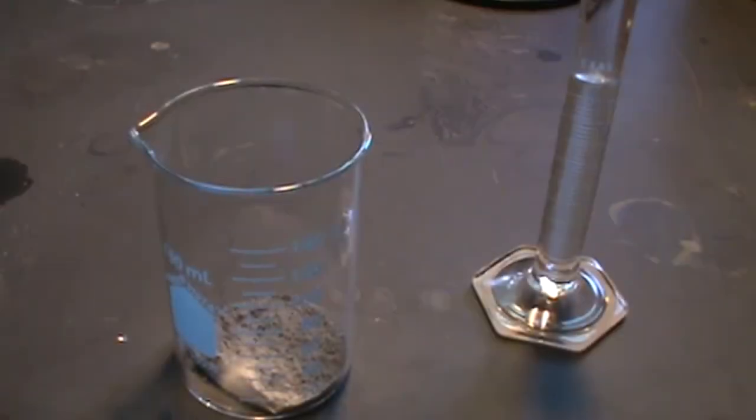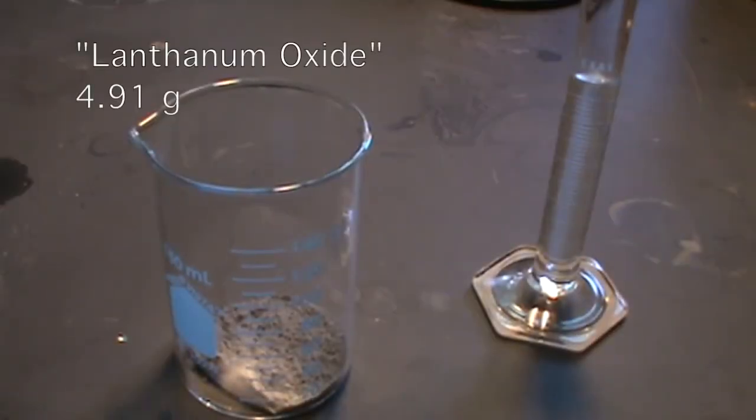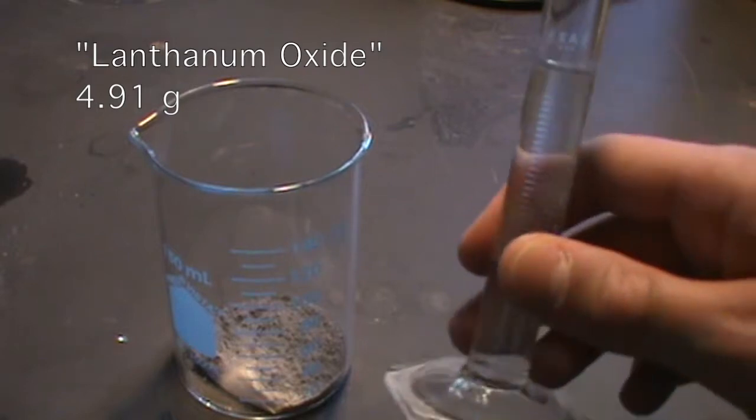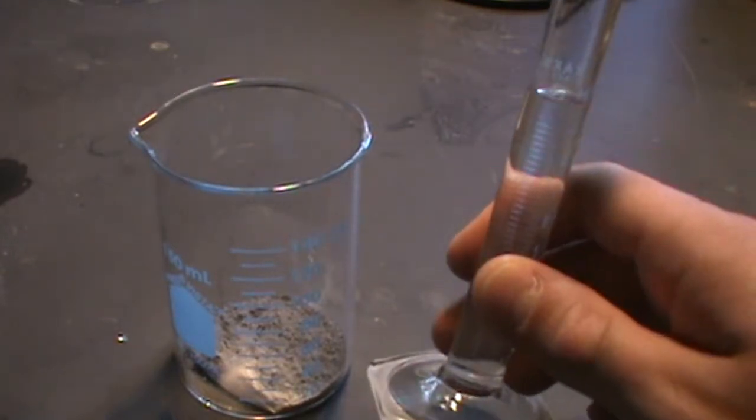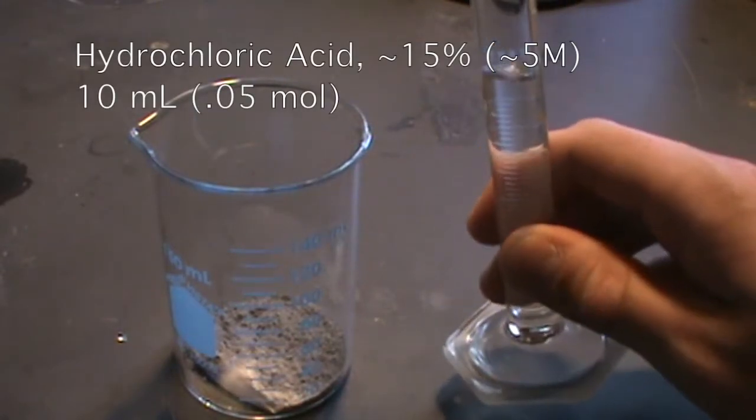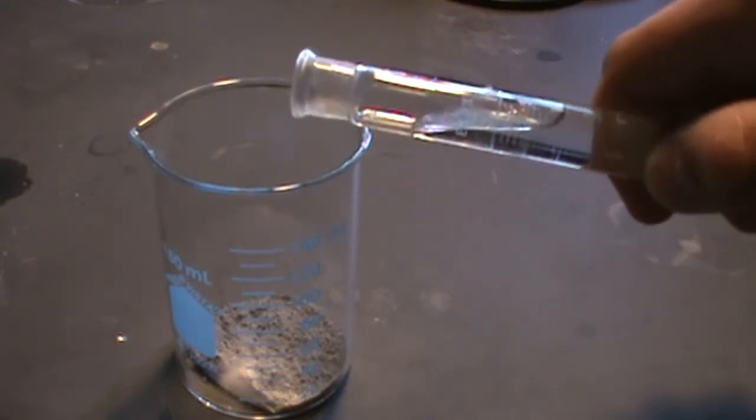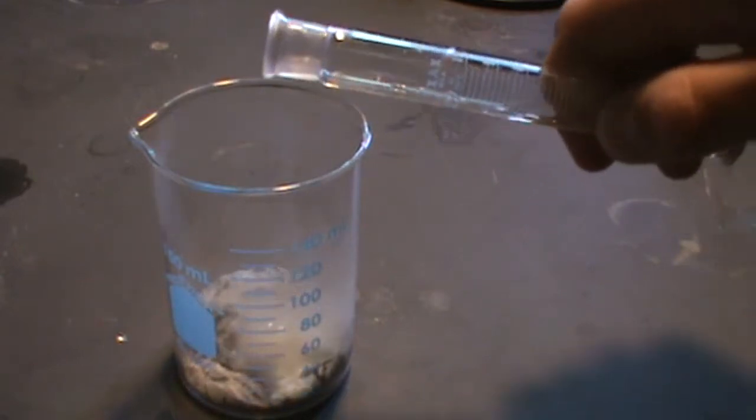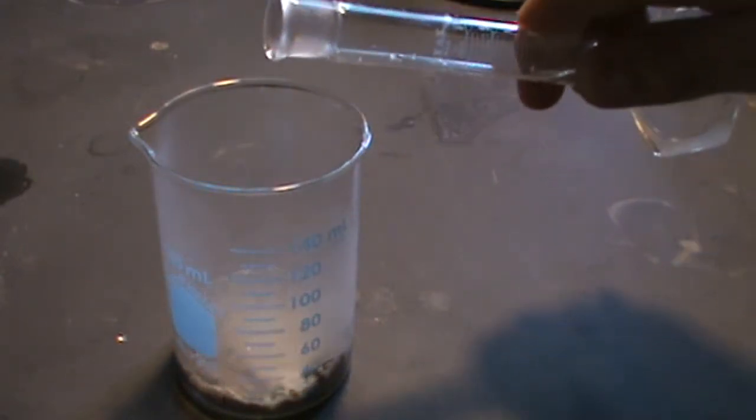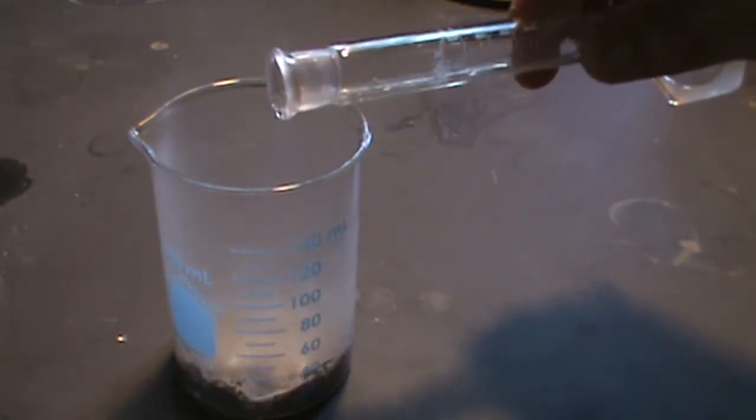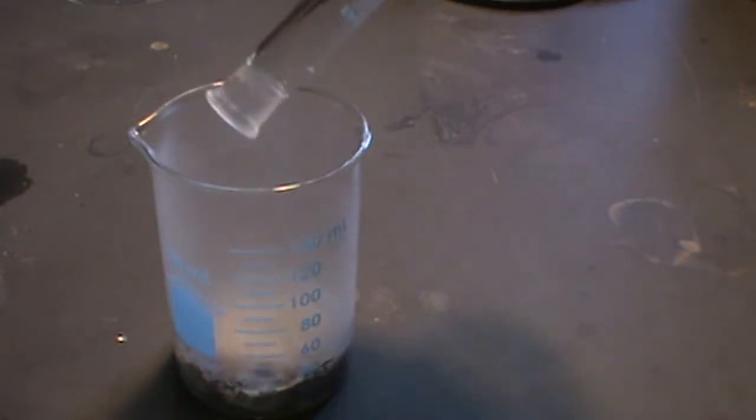First, the impure lanthanum oxide is added to a beaker, then 10 milliliters of 15% hydrochloric acid are added to it. There's an immediate hissing and bubbling, showing that there is some carbonate in this mixture, not just oxides.